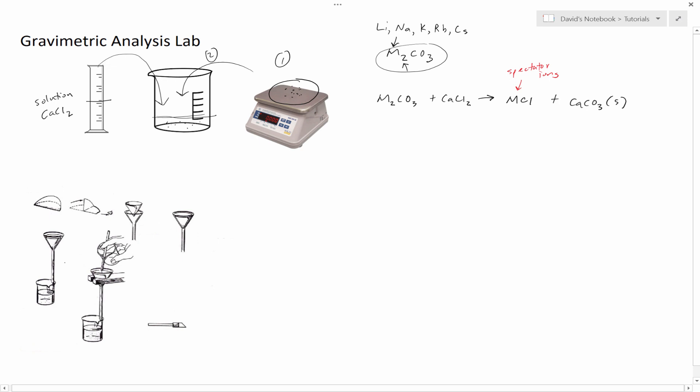We're going to set up our filter in our funnel. We're going to use a filter paper, put this in our funnel, and then this beaker will be this beaker here. What they're using right here is a glass stir rod to help aid the transfer of the calcium carbonate into this.